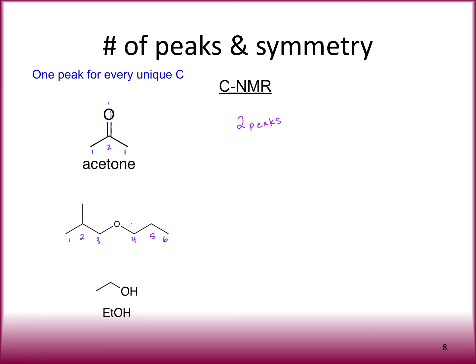This is really sensitive. Now, why did I not number this one? What does this one match? Right, this matches 1, so we can make a plane of symmetry here at this carbon.